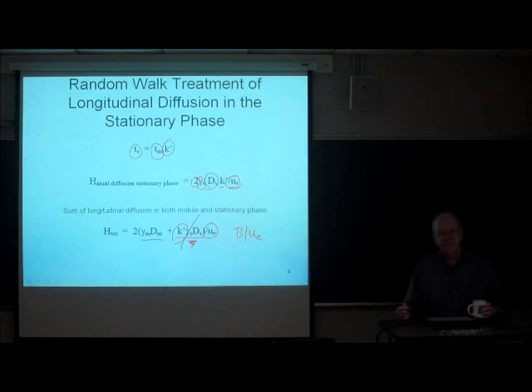In supercritical fluid chromatography, where the mobile phase is a supercritical fluid, which is a denser gas, if you will, diffusion in supercritical fluids is slower than in gases, but it's usually a lot faster than in liquids. So it's frequently the case that the second term in supercritical fluids is not very important.